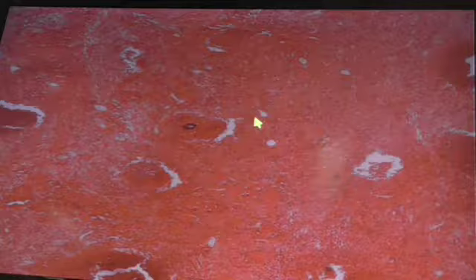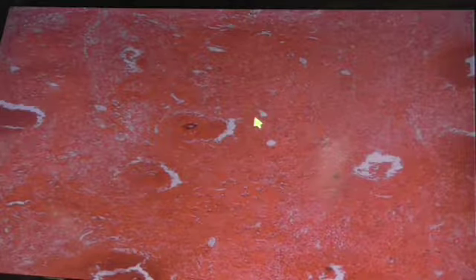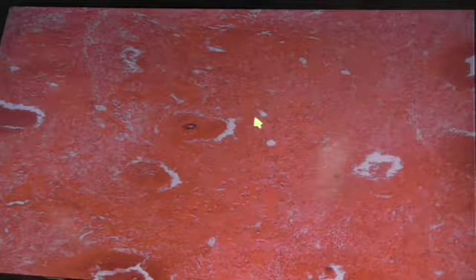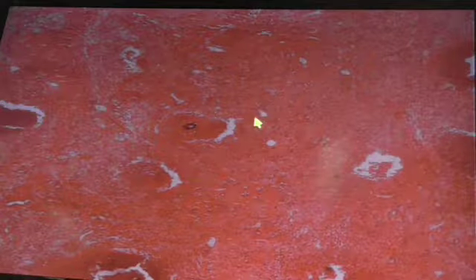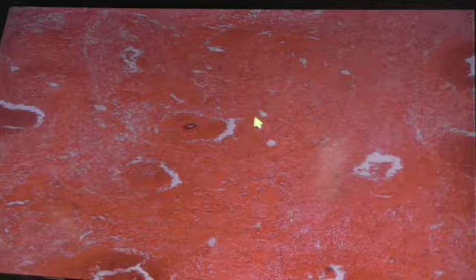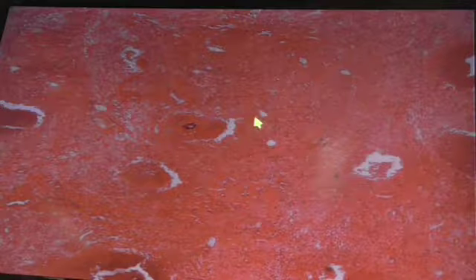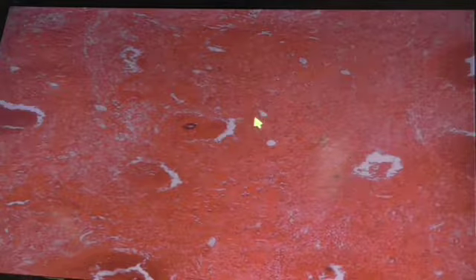Okay, so as far as the morphologic diagnosis goes, finding the aspirate, culture and sensitivity for sure. What about Gram stain? Yeah. Well, because guess what? These little dark areas that you saw in the center of them, which had the little purplish, reddish coloration, that's what your bacteria was. That's bacterial colonies. And if you look closely enough, you saw that some of them had these radiations.